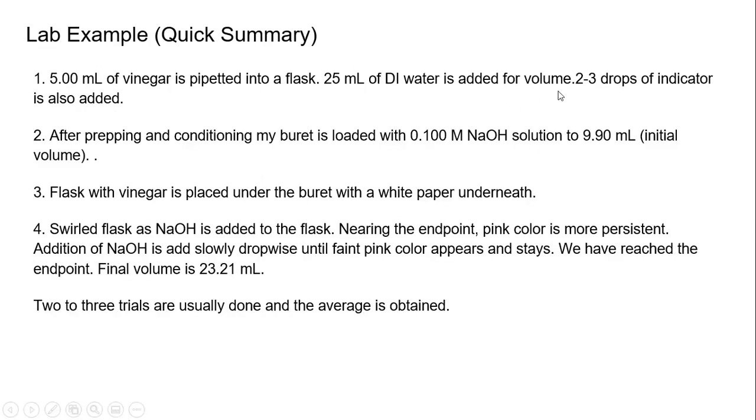These are instructions taken from another lab. They're only minor differences from the LabFlow lab, but this is a quick summary. There is more detail, and you definitely should be reading your lab, but this is just an overview. You add 5 mLs of vinegar into a flask that's pipetted. You're going to then add approximately 25 mLs of DI water.